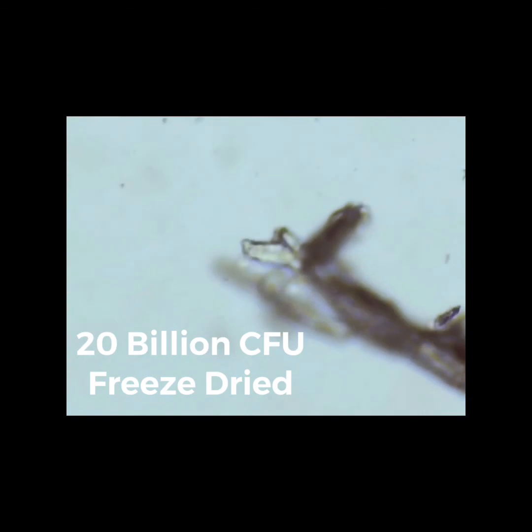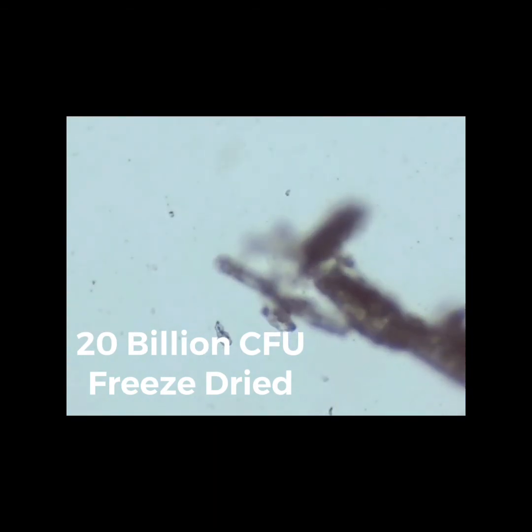I don't know for certain, but it sure does look like it. Here's magnification in and out and you can just see cellulose — the dead parts of the cell that was once living — and nothing wiggling, squiggling, moving with purpose, nothing glowing like with Your Biotics. It's just debris going with the current of the water on the slide.